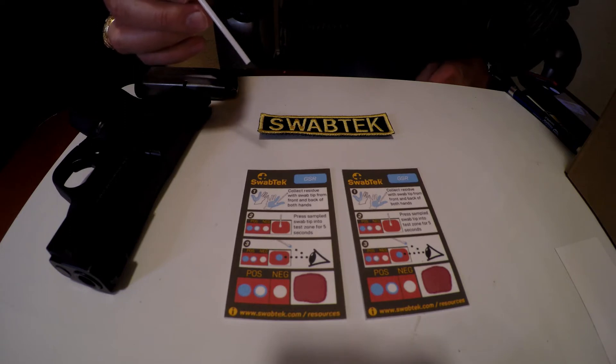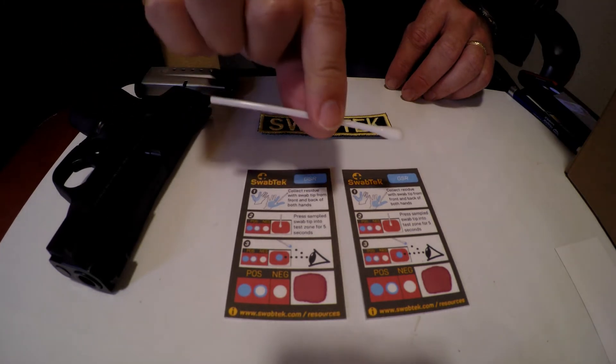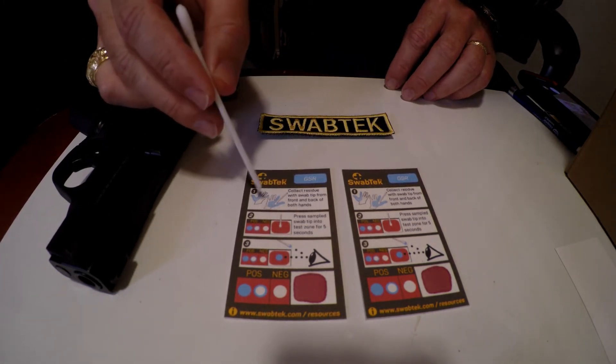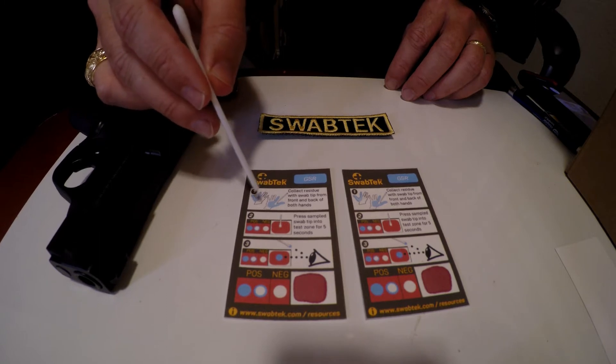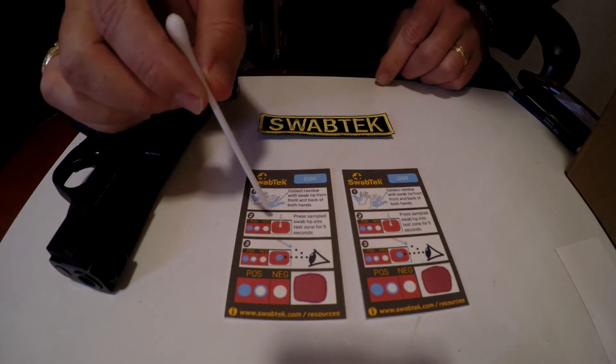These are the instructions for the Swabtec Gunshot Residue Test. In the test you will find a card and a swab. Follow the instructions on the card of where to swab on your hands. You also want to swab the back of the hands.